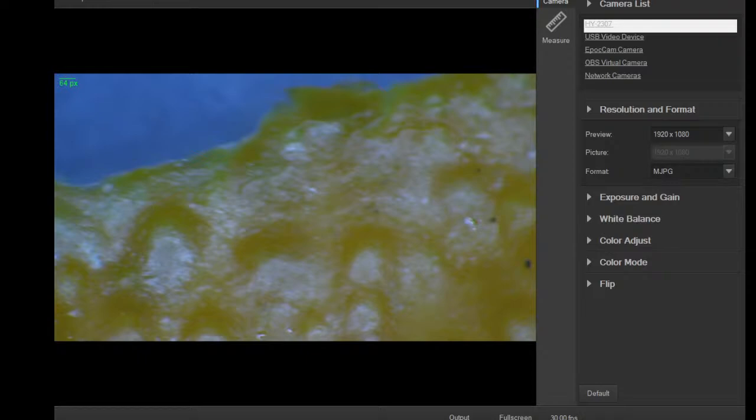So now I'm going to put a section. Let me get a thing so I don't get any moisture on my microscope. Take this little petri dish. Take a piece of the regular fruit, and I'm also going to rip it open so you can see the insides. Man, these are good. Holy moly, I could eat 5 of these right now.